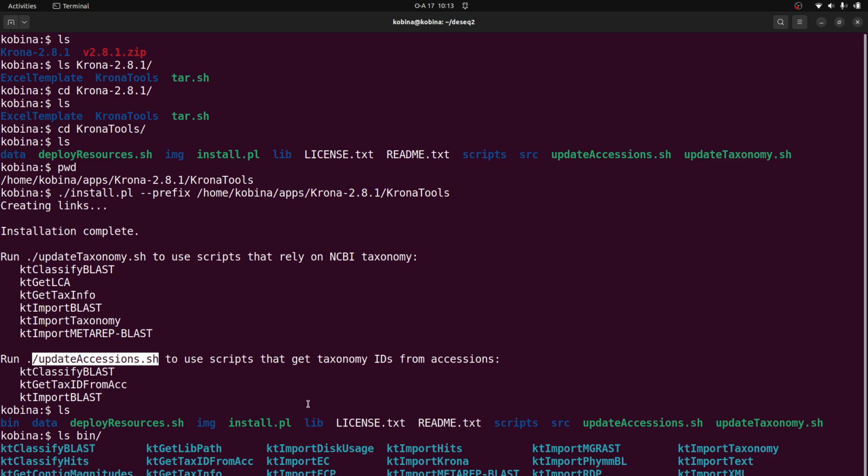we can proceed. These scripts are useful if you are going to do visualizations which involve NCBI taxonomy, like taxonomy visualizations. That's why we need to run this. Let's just keep that in mind. It's very important, this and this. These scripts, you can find them in the installation directory. We have them here, this and then this. We need to run them in this order.